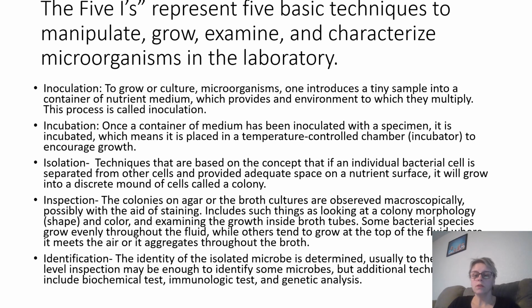Some bacterial species grow evenly throughout the fluid, while others tend to grow at the top of the fluid where it meets the air, or aggregate throughout the broth.